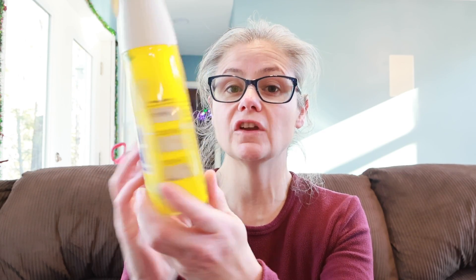So this product did really well. Mr. Clean Clean Freak seemed to remove a lot of bacteria from the hard and non-porous surfaces from around my home, even though they make no claims to be able to do so. Nowhere on this packaging at all do they make any claims that they're a sanitizer or a disinfectant - it just says that they are a multi-purpose cleaner. This product does have a very interesting sprayer - it is not a classic trigger spray. You spray it and it kind of sprays for a longer period of time. I'm not a huge fan of that kind of sprayer, but it did work well at coating the area with the cleaner.